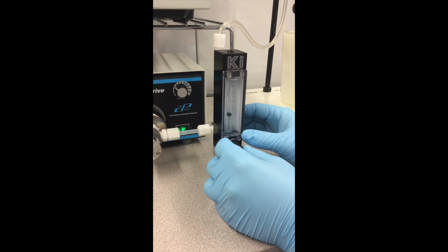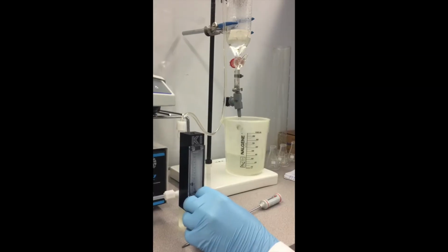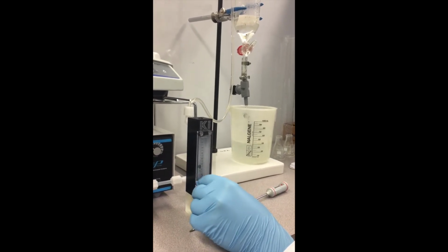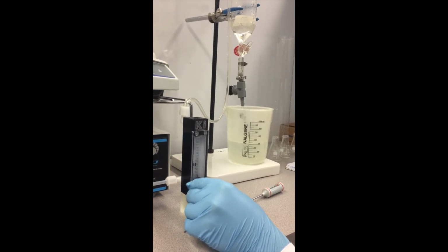To determine concentration from the absorbance value that was recorded, we used a calibration curve. This was a simple calculation and only required the equation for the linear line given from the slope of the calibration curve. To determine the corresponding real-world flow rate from the arbitrary reading given on the pump, a flow rate calibration was run. For this, we collected water over a specified time interval in a beaker. After massing the beaker before and after, we could determine the actual flow rate in milliliters per second.